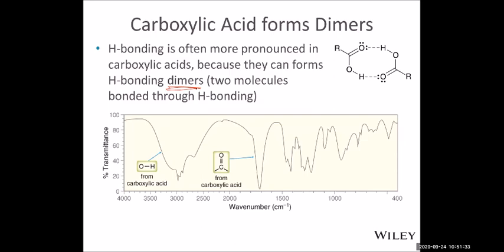Solvent. Nowadays many infrared measurements are done on the pure sample, without putting it on a salt plate like we mentioned before, or just the powder itself is put on the infrared and measured directly, like in our lab. In the older days, organic compounds were not soluble, so we had to put them in solvent. The solvent molecules can interact with solute molecules, with sample molecules, so there will be an effect on the appearance and absorption strength of the infrared. Nowadays we don't really use that, but we should be aware of what kind of environment, what kind of solvent we use, because that can cause differences in the infrared: the appearance, the strength, the wave number.